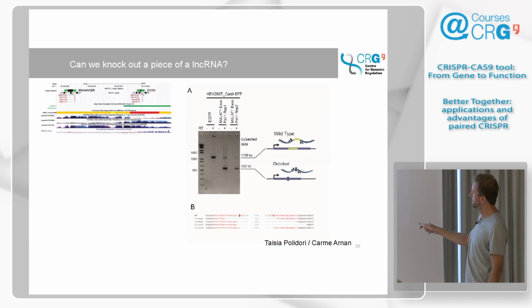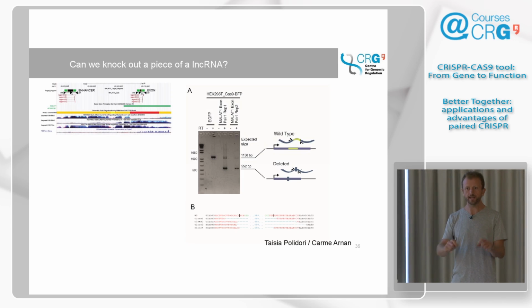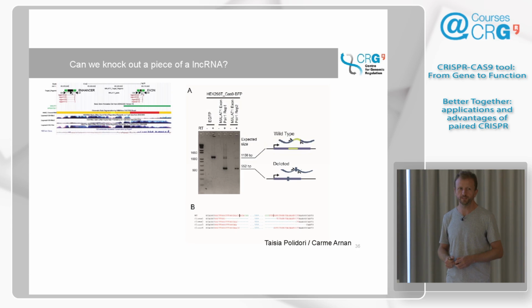And what's nice then is that in the knockout cells, you see the appearance of this short band in the cDNA. So not only are you deleting in the genomic DNA, but that's also getting into the RNA, which is exactly what you would want in these experiments. And you can also use the same approach with the TA cloning to look at the deletion sites. And again, none of them, or only one of them, matches what it's supposed to be. So it looks like it's quite promiscuous and non-specific, the exact position that the nuclease is attacking.